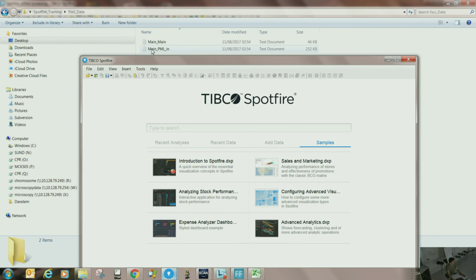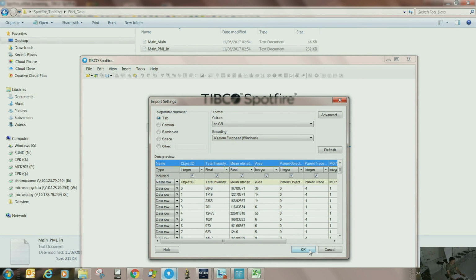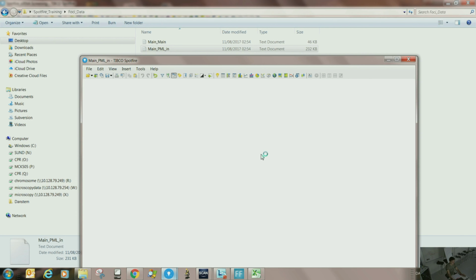First, drag and drop the sub object, because we want the number of rows to be the same for the sub object, right? It is okay if one foci has multiple main object criteria. So I'm just dragging and dropping the sub object, which is basically the foci related features.